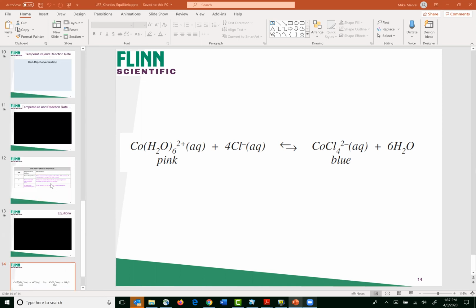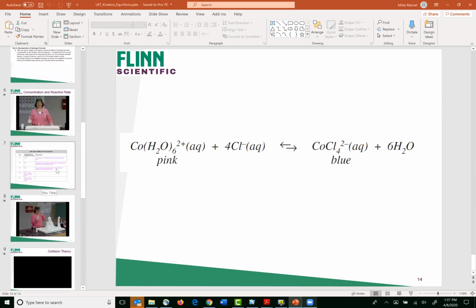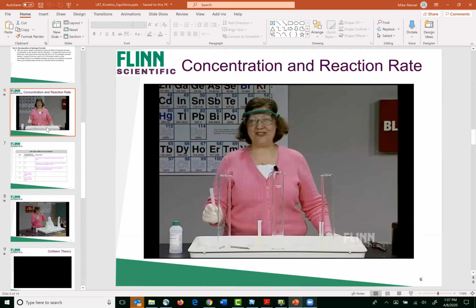What can I say? The biggest thing in this experiment that I want to reiterate is that you're trying to determine the effect of concentration on reaction rate. This is semi-empirical. You're not coming up with what we call a rate law, which would quantify this a little better. But qualitatively, this is science 101. We don't have to overthink this. If we have 3 flasks and we vary the concentration of our hydrogen peroxide across the flasks and control everything else, we can see the effect of that concentration on the reaction rate insofar as how fast it decomposes.